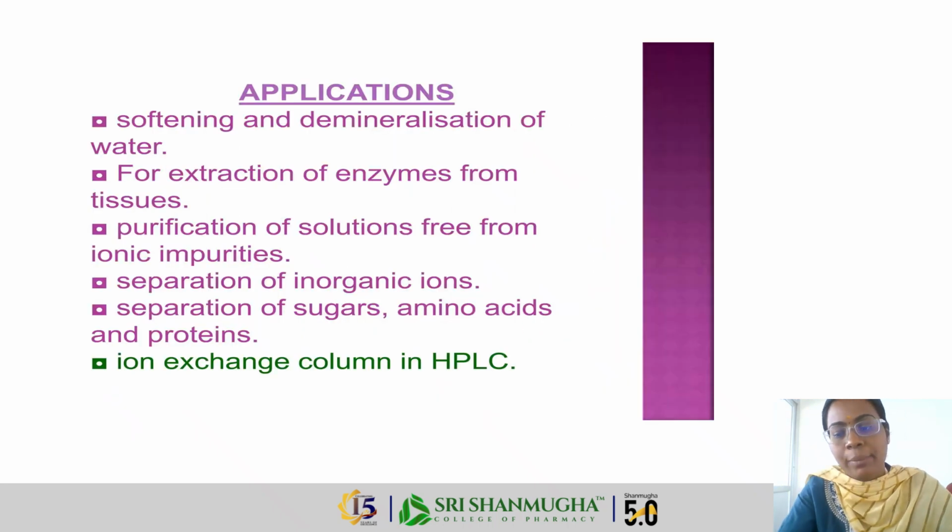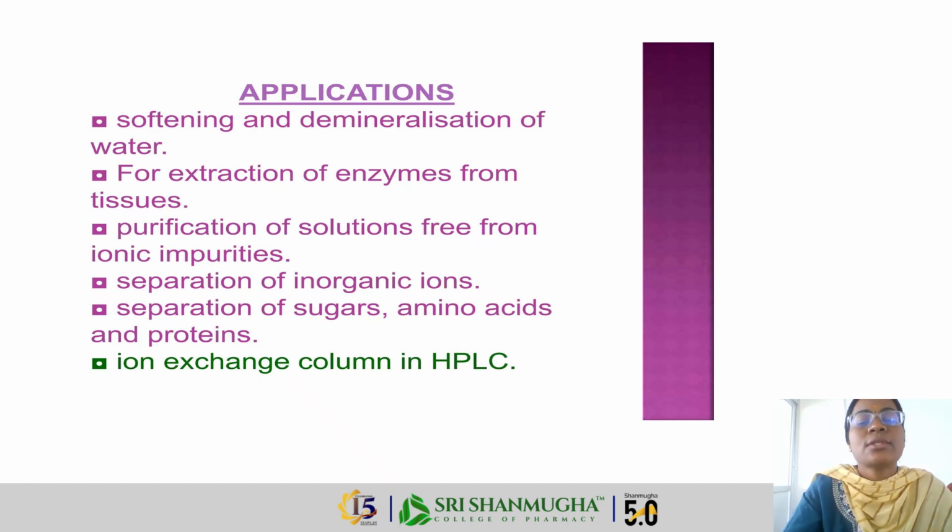What are the applications of ion exchange chromatography? First is softening and demineralization of water. We also use ion exchange chromatography for extraction of enzymes from tissues, taking multiple enzymes from multiple tissues of animals, plants or humans. Then the purification of solutions free from ionic impurities, removing impurities from multiple solutions, enzymes or molecules.